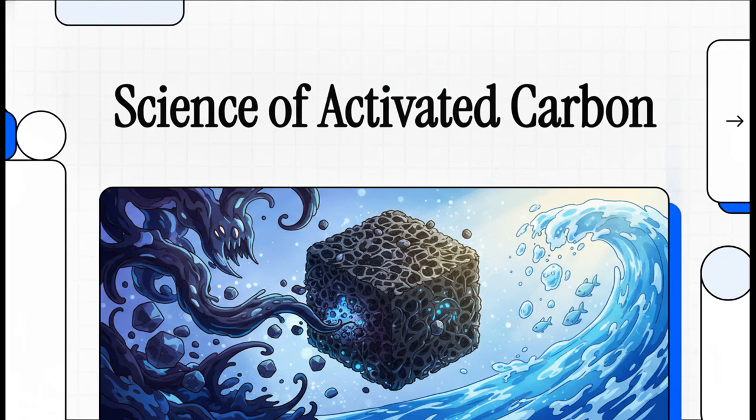Welcome to Dr. Kim. In this explainer, we are jumping right into a fascinating experiment where we will study the adsorption of dyes using activated carbon. It's an incredibly simple yet wildly effective method for removing colored impurities and toxic pollutants right out of our water.